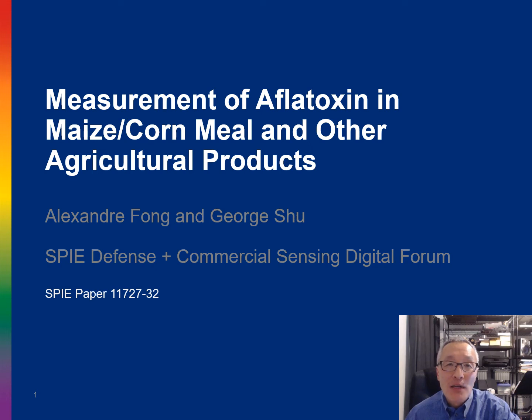Hi, I'm Alex Fong, Vice President of Engineering at Hinalea Imaging TrueTag Technologies, and I'll be discussing our work in the detection and measurement of aflatoxin in maize, cornmeal, and other agricultural products using hyperspectral imaging.